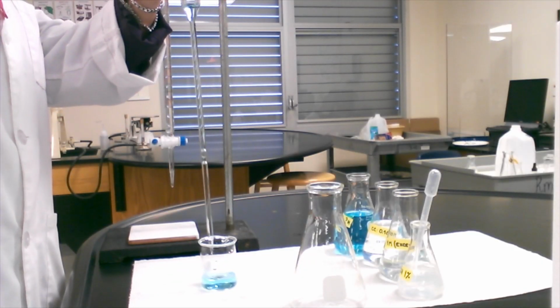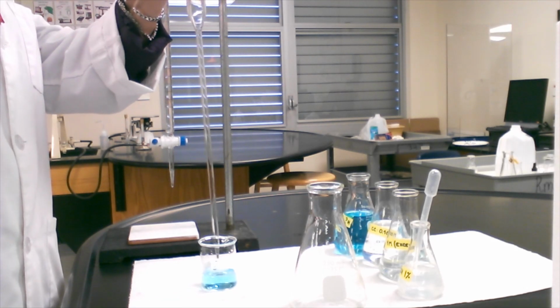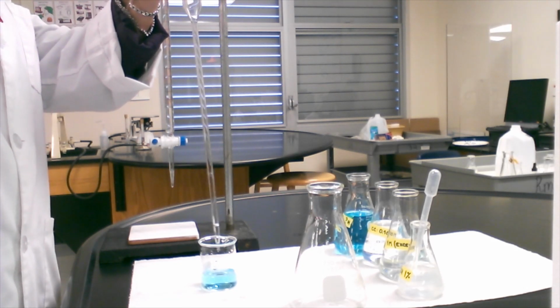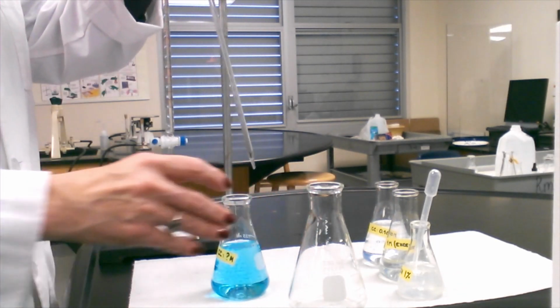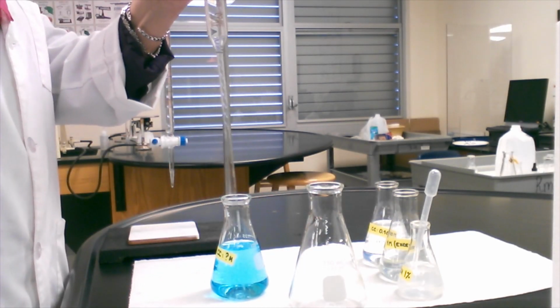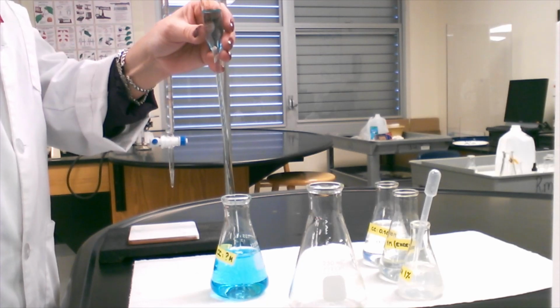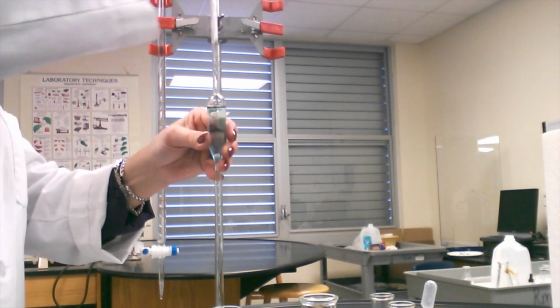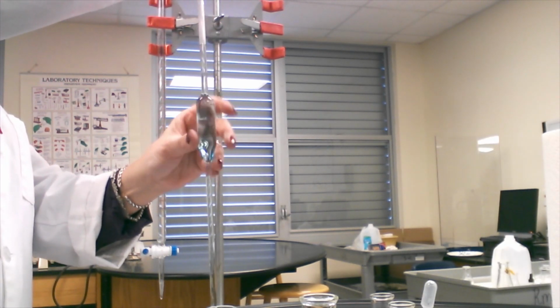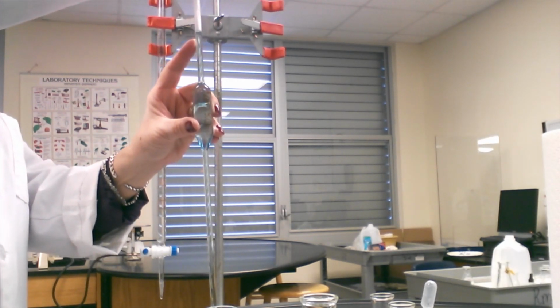Okay, so we are going to release the liquid. And now we can refill it with a clean one. I'm going to get to the volume that is marked there, and then holding the wheel, I'm going to transfer that.